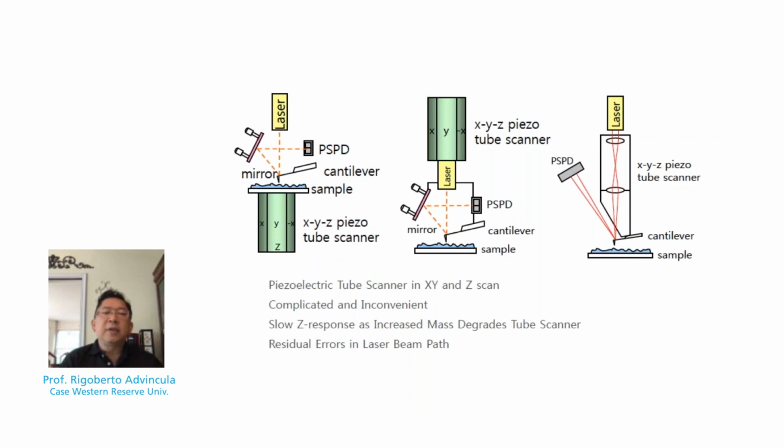The advantages of an AFM can also be related to ability to couple it with other instruments or other experiments. So for example, in the past, we have actually coupled AFM together with surface plasmon resonance and even electrochemistry to come up with an AFM SPR combination. An open system such as the other side of the substrate or surface can be accessed optically or using a QCM circuit enables us to do what we call hyphenated techniques.